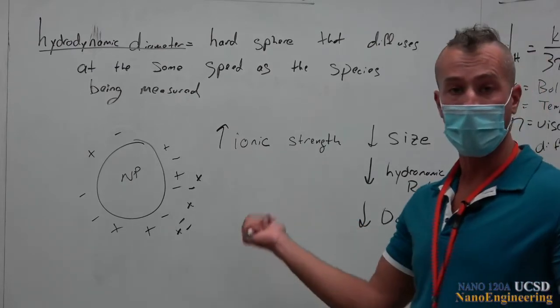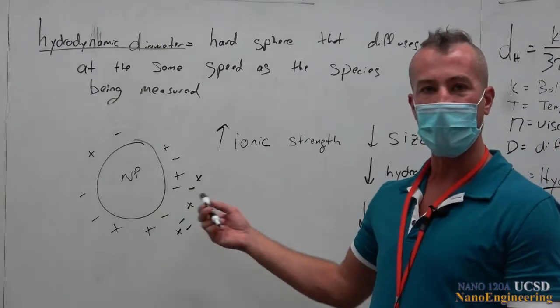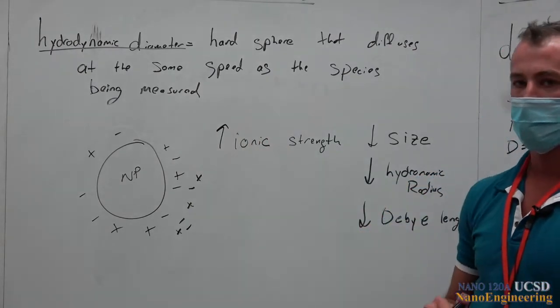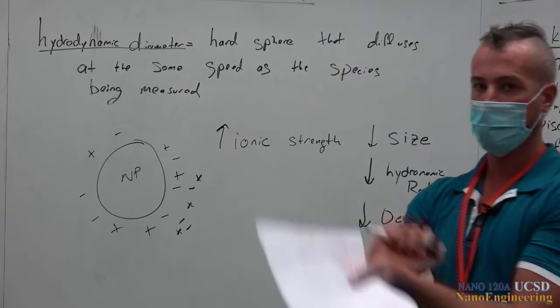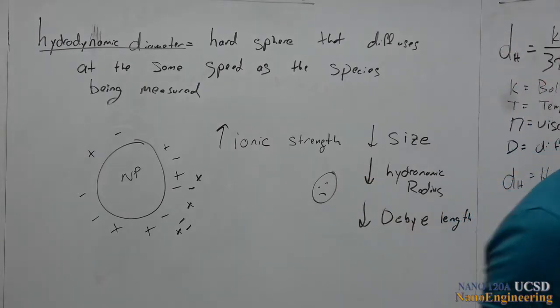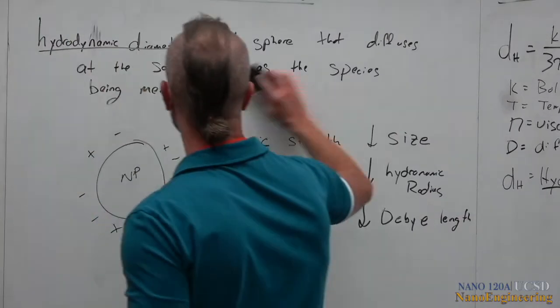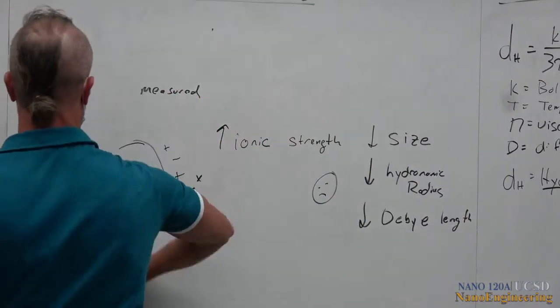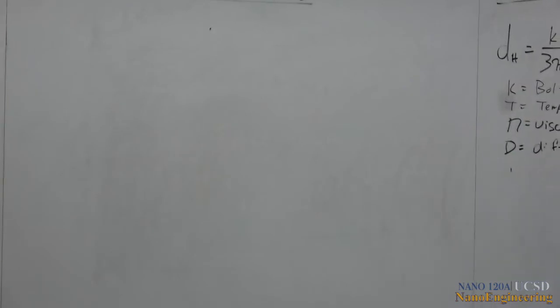This is why a lot of particles don't do well in salts, right? If there's so much salt, the solvent loses interest in holding on to the particle, right? And therefore, the particles are more interested in holding on to each other. Falling out of solution, sad face. Okay, so this is some of the mechanics that is underlying this. I'm going to save this for now. Okay.